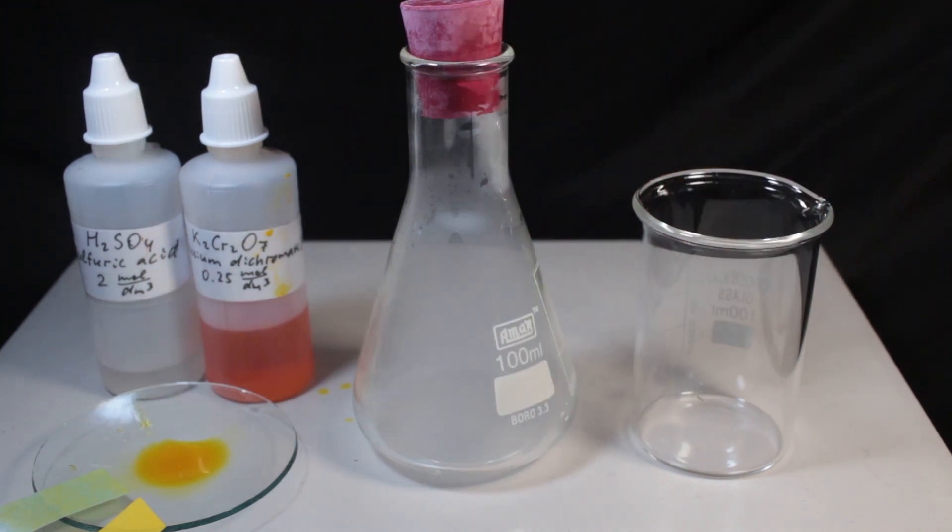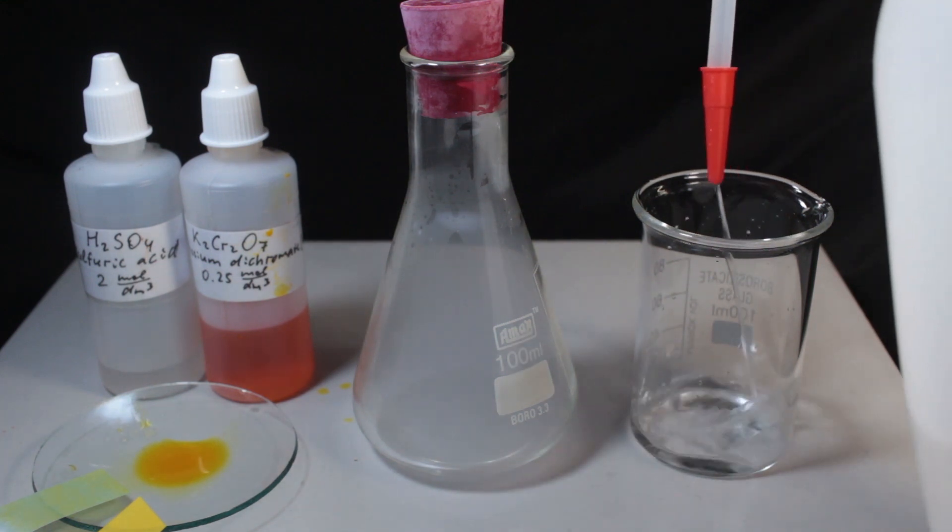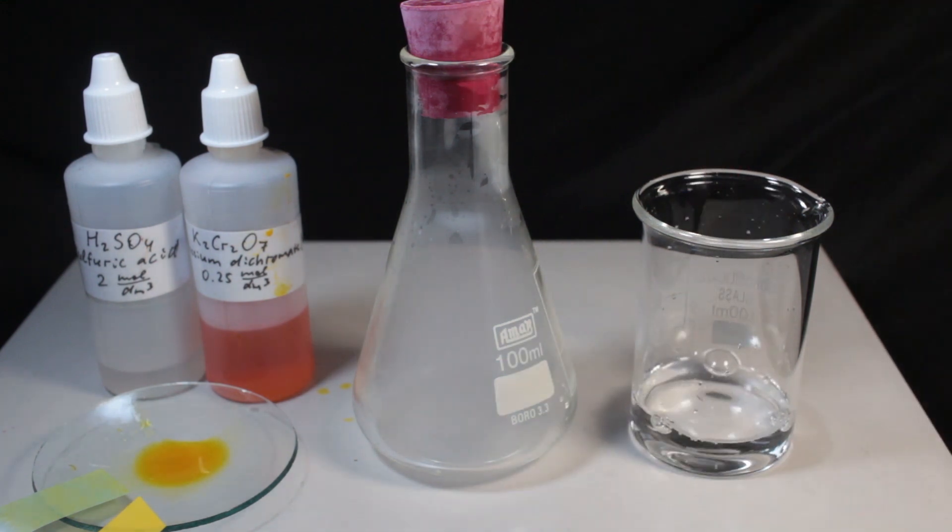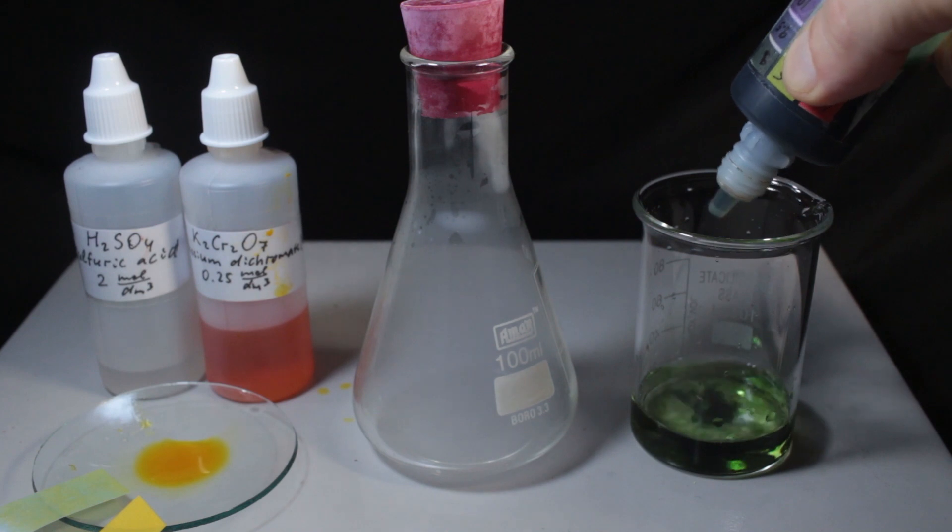And now for another property. Acidic properties. We say that sulfur dioxide is an acidic gas. Let's check it with water. Clear distilled water with universal indicator on it.